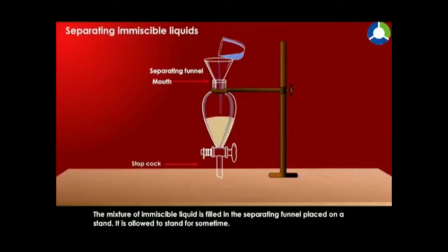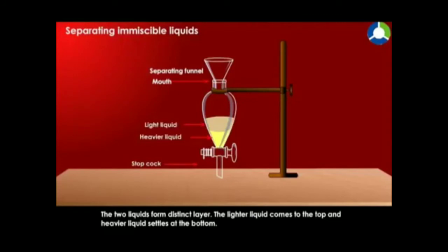The mixture of immiscible liquid is filled in the separating funnel placed on a stand. It is allowed to stand for some time. The two liquids form distinct layers. The lighter liquid comes to the top and heavier liquid settles at the bottom.